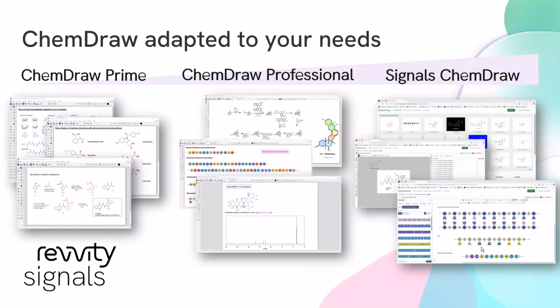Signals ChemDraw is the ultimate version of ChemDraw. It's a cloud-based solution that allows you to manage molecule and reaction data with your web browser. And this version of ChemDraw is a perfect tool to share, collaborate, and make reports.